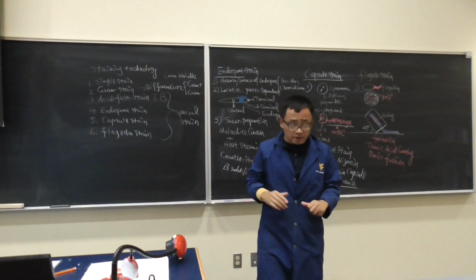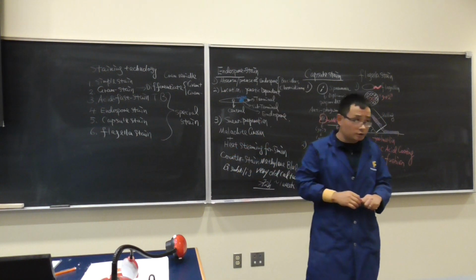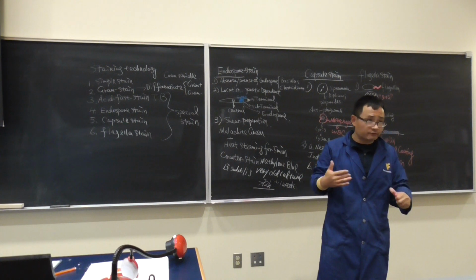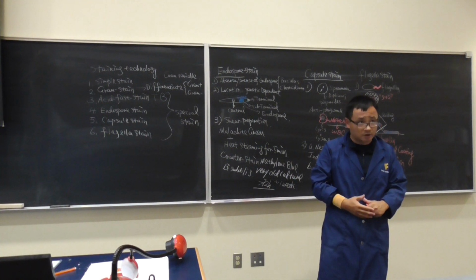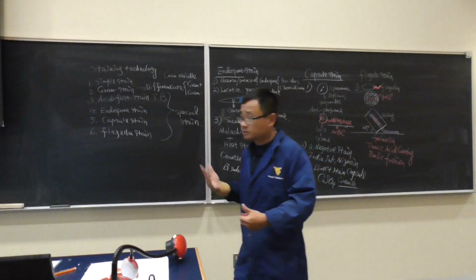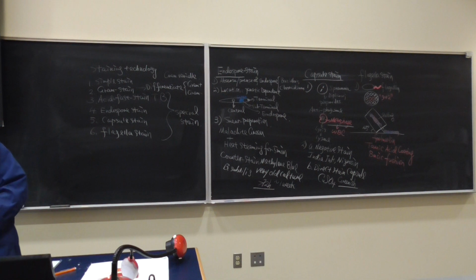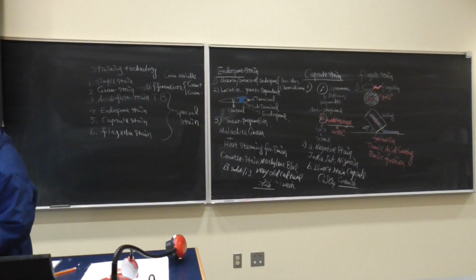Now, why is the flagella important? Because the flagella stain certainly tells us the bacteria have a very strong moving capability, because it's a real move, not like a vibration. And you can see a very typical example for the flagella stain is this one.